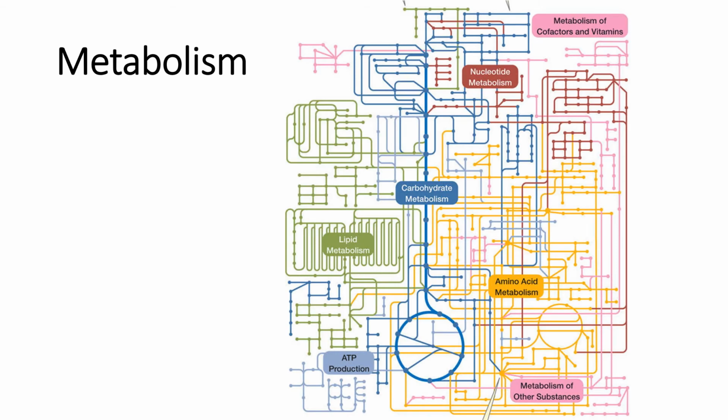With the carbohydrate lab, I showed you this figure, which shows a lot of the different pathways for different types of metabolism. And last time we focused on the carbohydrate metabolism. This time we are focusing on amino acid metabolism. So building your biochemical profile means you are determining which biochemical reactions your bacteria can perform. And to do this, we use indicators. So various indicators that determine if certain reactions are going forward or not.